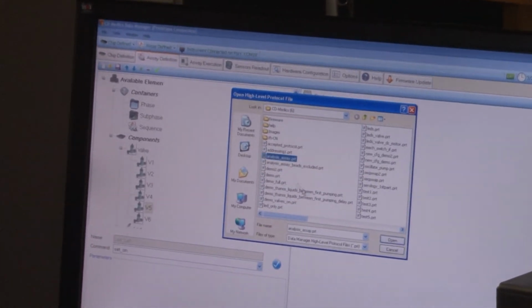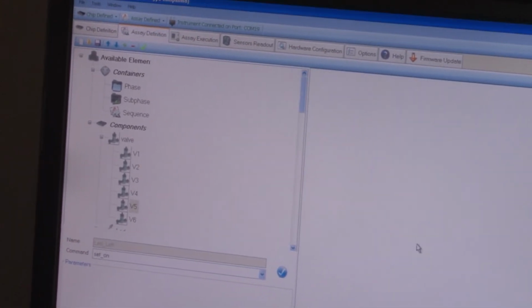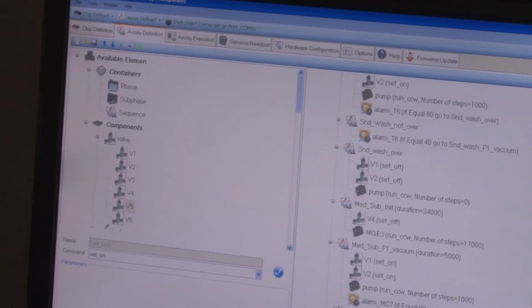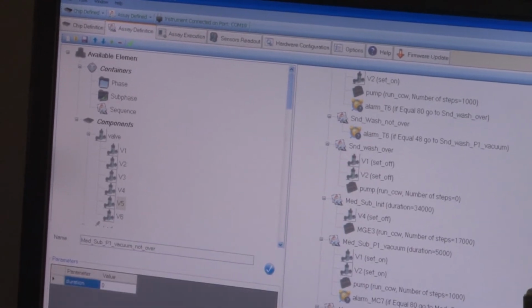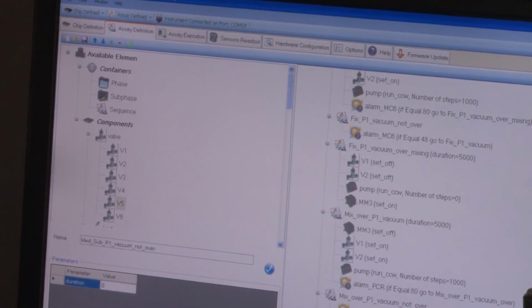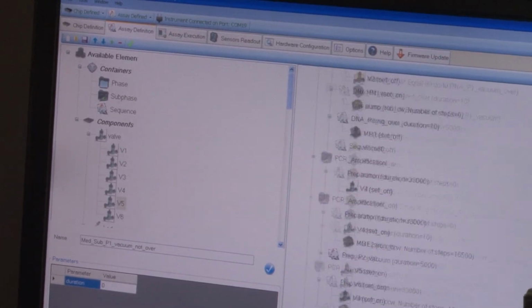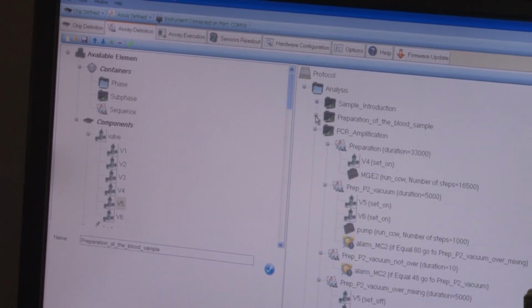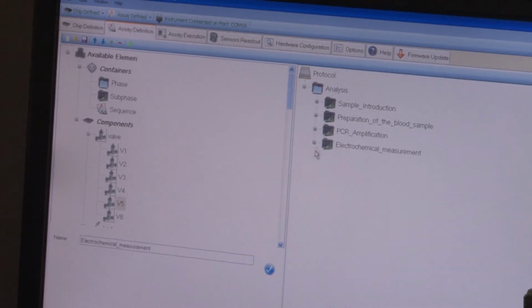One of these is the assay I'm going to show now. Yeah, it takes some time to load. As you can see, it is one very big assay. What this does is a complete analysis for the CDmedics project, the Celiac disease.